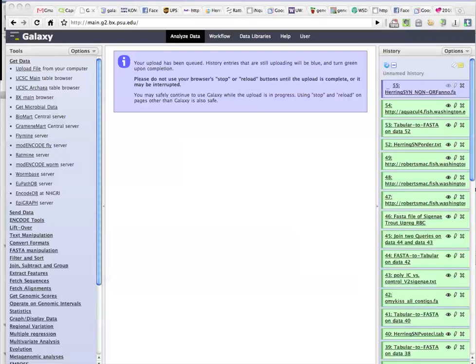This is the second part of how to eventually identify the SNPs that are changed at the amino acid substitution. So this relies on using some different tools. I use Galaxy, a free tool.